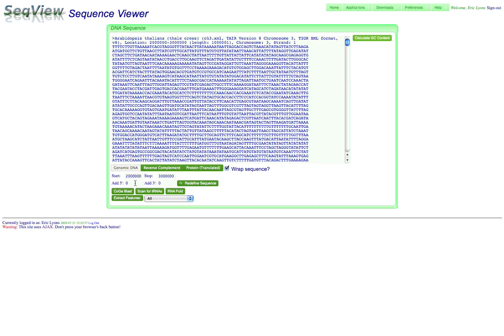This tool allows us then to send the sequence to other tools for analysis. So we can send it over to CoGe Blast, we can scan it for tRNAs, we could send it over to ViennaFold for looking for secondary RNA structure. Again, probably not a useful thing to do with a megabase of sequence.